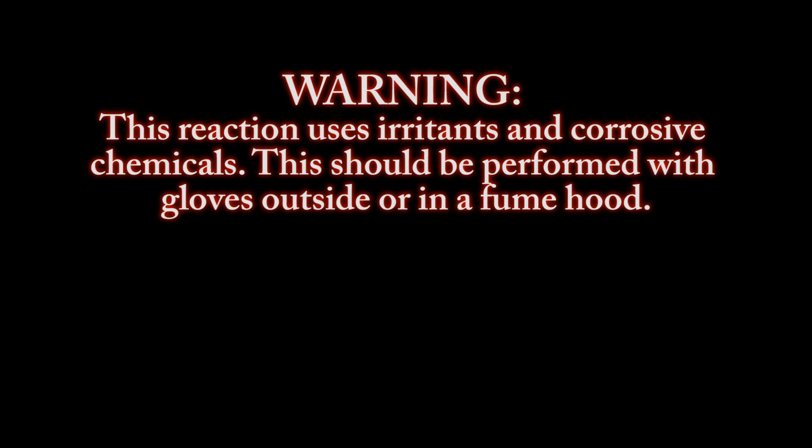Warning: this reaction uses irritants and corrosive chemicals. This should be performed with gloves outside or in a fume hood.